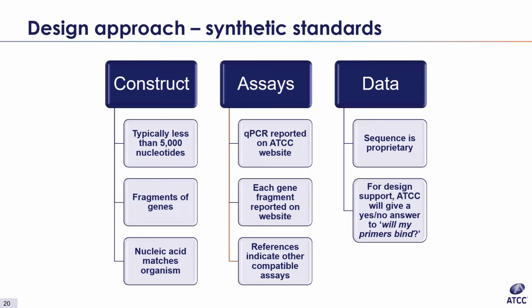We recognize that you need a starting point for your work, so we do report an assay that we've confirmed to work on the website. Other assays can be determined by looking at the gene fragments included in the construct, or at the references on the website. The actual sequence, though, is proprietary, so we can't disclose it, but we're happy to confirm whether your primers and probe will bind to it.